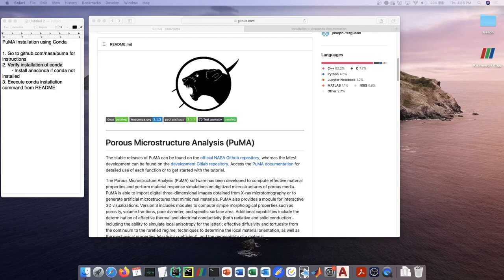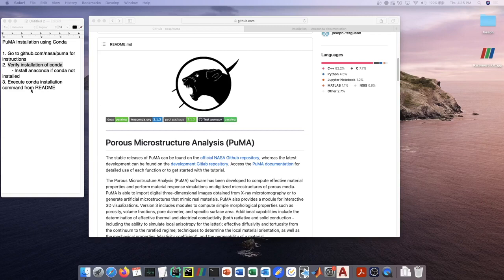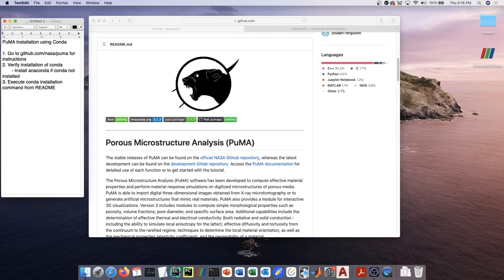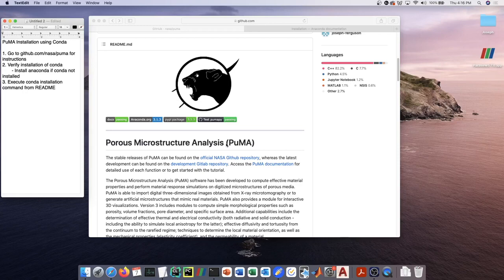With that in mind, there are two different ways of installing PUMA. The first, most straightforward way, which is what I'll talk about in this video, is installing PUMA using conda. Conda is a tool to manage environments in order to make sure that software runs smoothly between different systems.